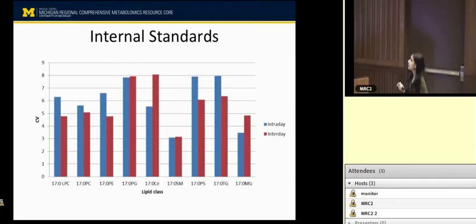In the raw data, most of our lipids are identified because we are using a semi-targeted search. So we give the name of the lipids, and then the RSDs for our test pools. Then the class information, what class they belong to, the mass window where the compound is searched, and the retention time. The known/unknown tag that we add is based on whether the lipid has an odd chain fatty acid. Then we call it unknown, because odd chain fatty acids are not that common, and the rest of the even chains are named as known.